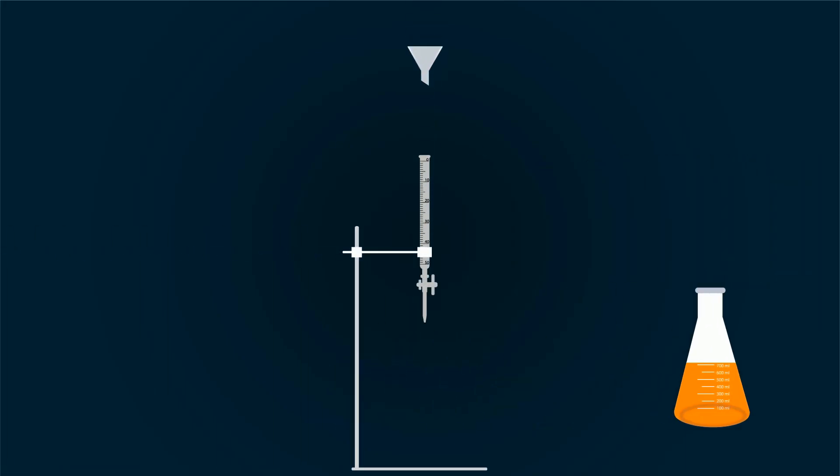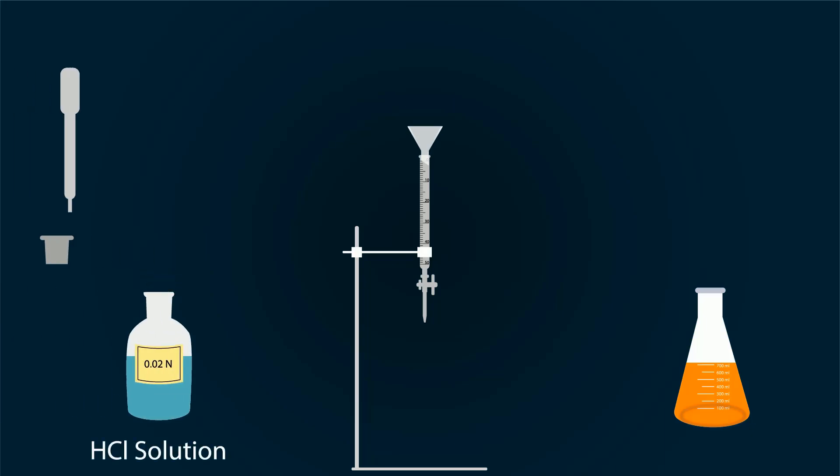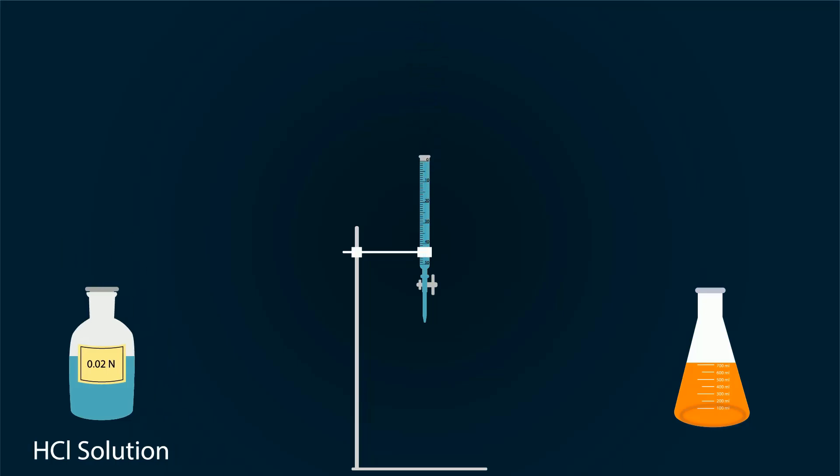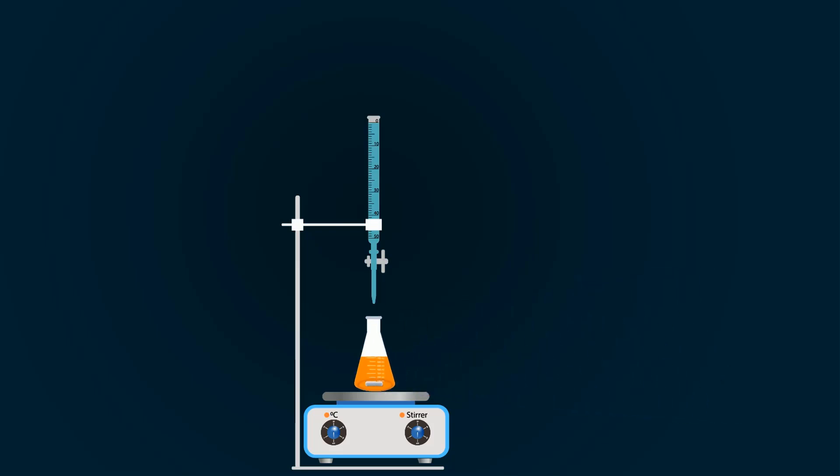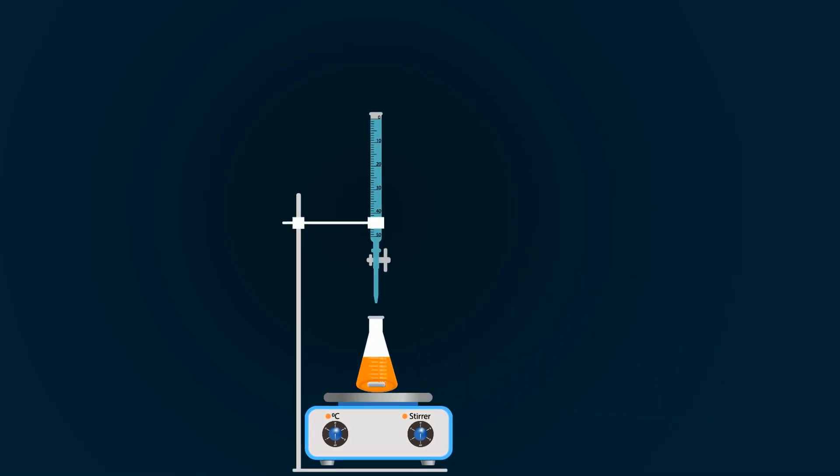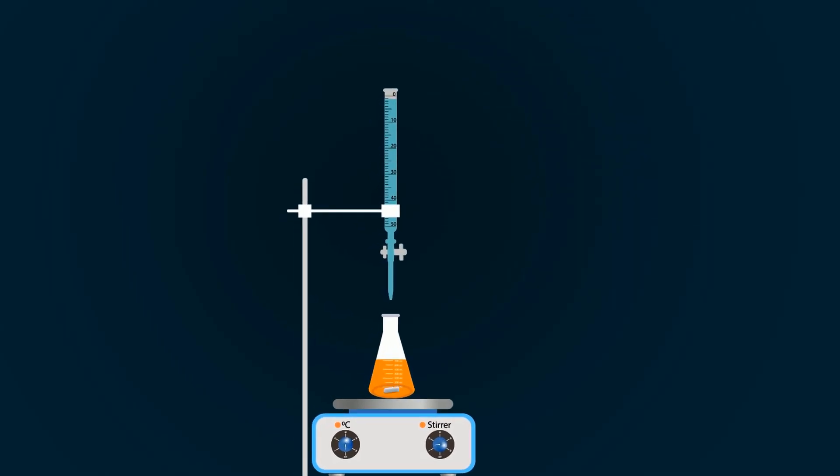For titration, take a stand and adjust burette on it. Don't forget to add funnel. Fill this burette with 0.02 normal HCl solution up to the 0 point. Adjust the magnetic stirrer below the burette. Add magnetic bar into the conical flask. Put the conical flask on magnetic stirrer and turn it on for homogenous mixing. Start adding HCl solution dropwise.